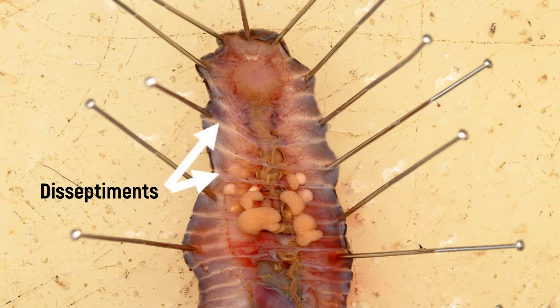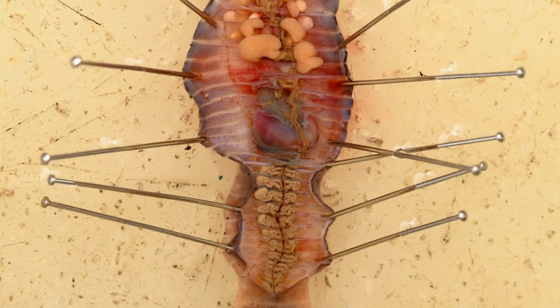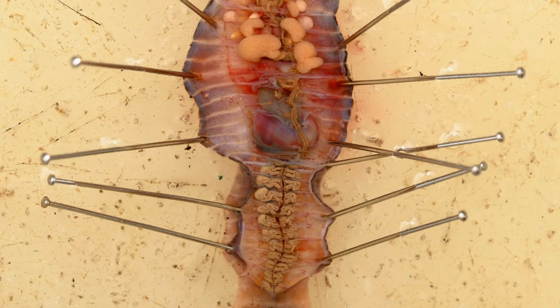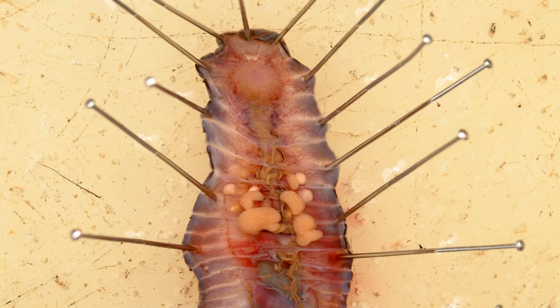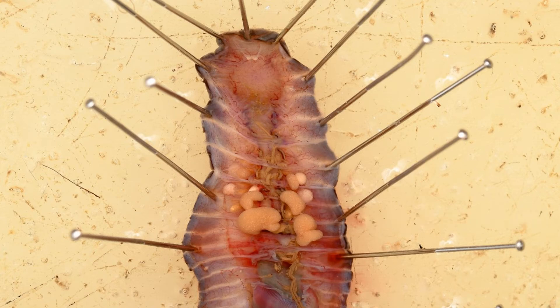The dissepiments are delicate, fenestrated walls that only imperfectly separate the body segments. They attach to the intestine and the body wall and are only missing in the foremost segments. In every segment, there are tubular structures lying in cross loops to the right and left of the intestine — the nephridia — which serve as excretory organs for earthworms. They are only missing in the first three and in the last segments. The three pairs of large yellowish-white seminal vesicles are immediately noticeable when the body wall is opened. These are sac-shaped protuberances of the dissepiments in segments 9 to 13; when strongly developed, they envelop the esophagus dorsally. The sexual apparatus also includes two pairs of seminal receptacles — invaginations of the integument that are closed towards the body cavity — conspicuous as white, spherical structures lying laterally in the 9th and 10th segments.